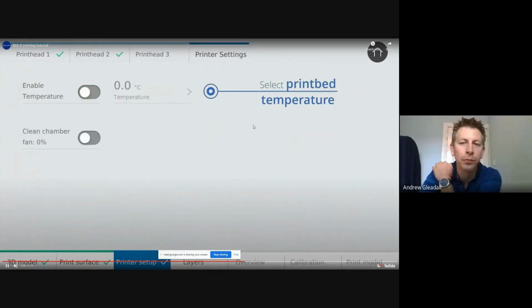So then there's going to be lots of different aspects of your printer as well that you can control. In all cases, if you're printing a melted polymer, there'll be the options to have fans to cool that. There'll be the options to have a warm print bed, and that will mean that the material will stick to it a little easier rather than cooling very quickly and then having a tendency to peel off.